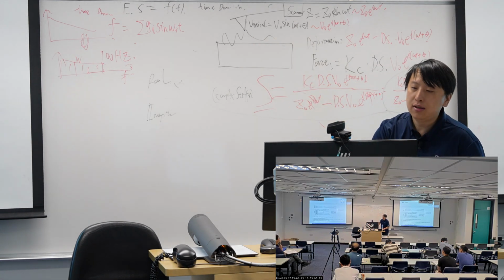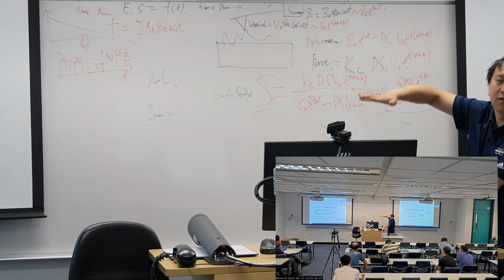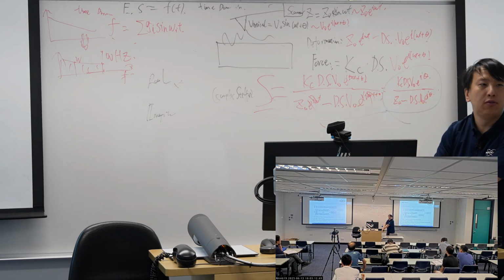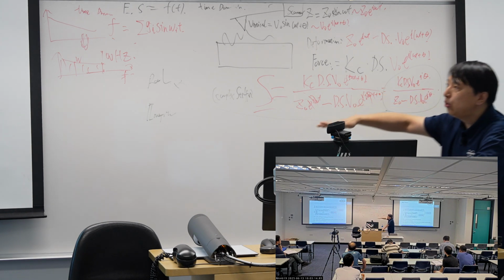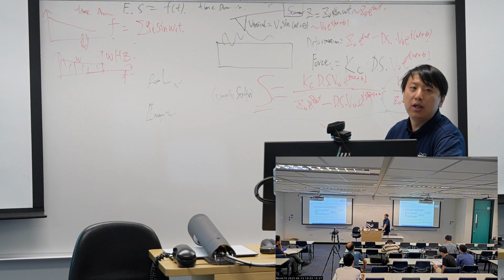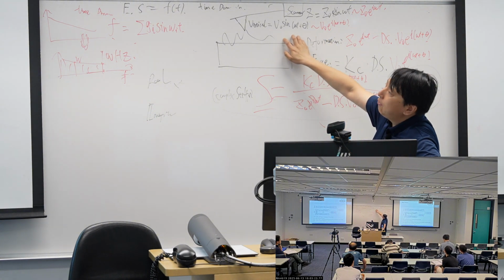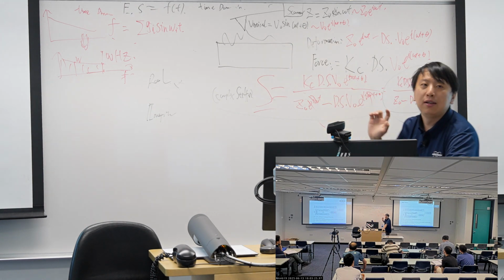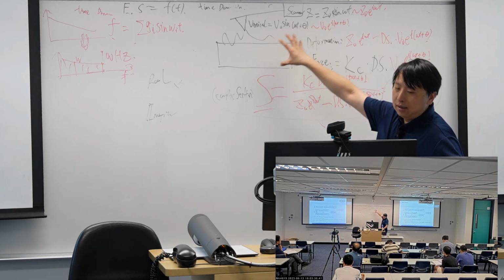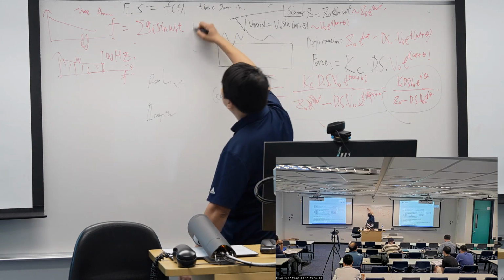We still need to hold our probe on the surface and stay for a while. During the hold, we apply this kind of modulation, or periodic force. After that, we can retract and get the force down. So nanoDMA is based on ramp and hold.